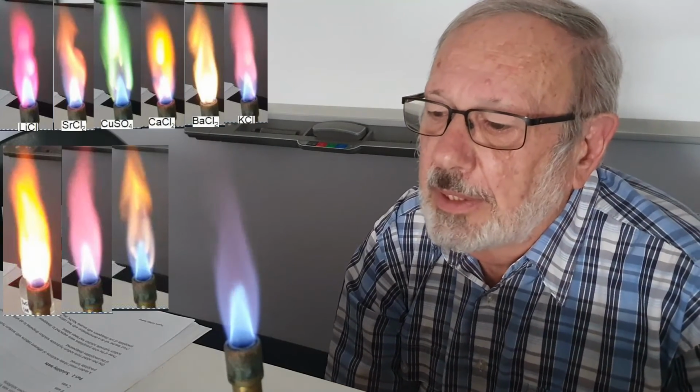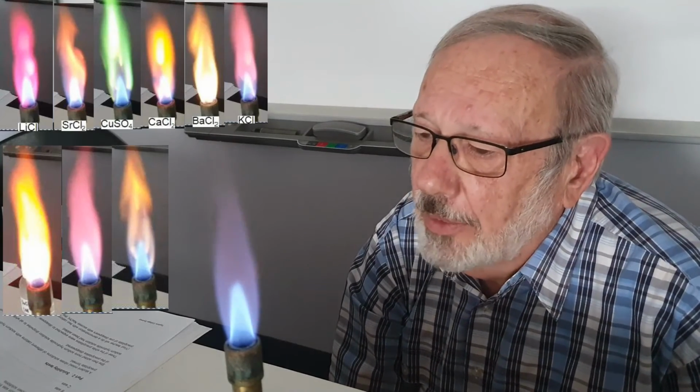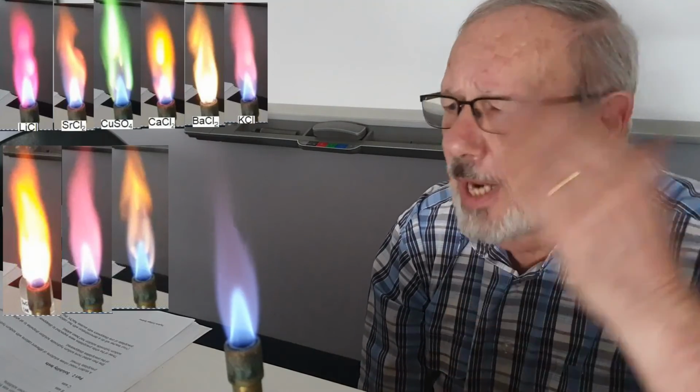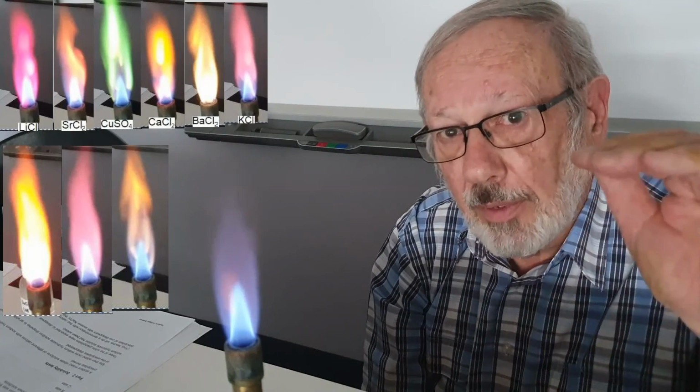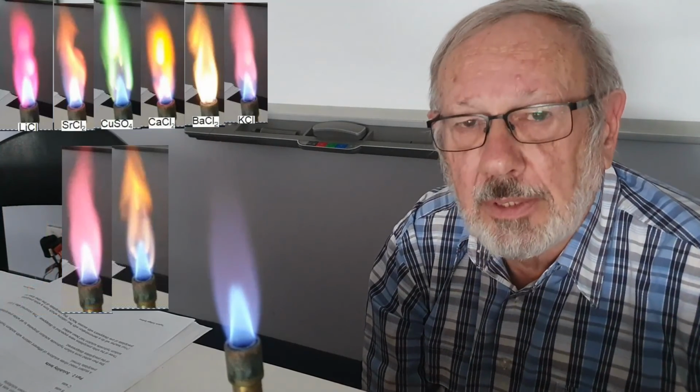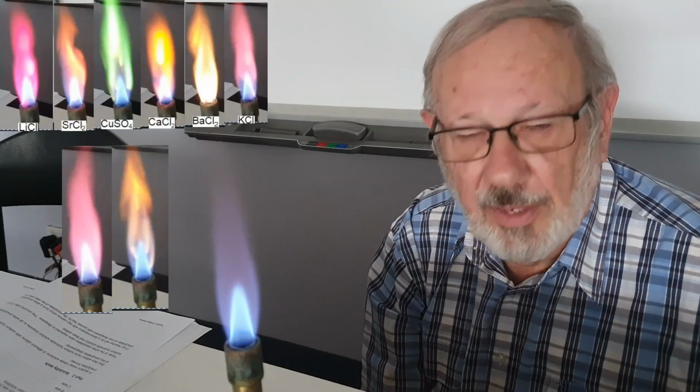Now, it's interesting to understand why it is that these cations give out this colour, and what happens is that in the flame the electrons are excited by the heat of the flame, and the electrons in the ion jump up, so to speak, into a higher energy level, then fall back down. And when they fall back down, they give out certain frequencies. And it's those frequencies that indicate their colour. We'll have a look later at other methods of identifying cations.